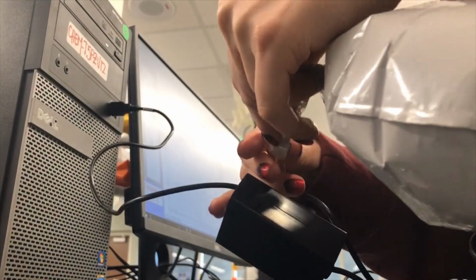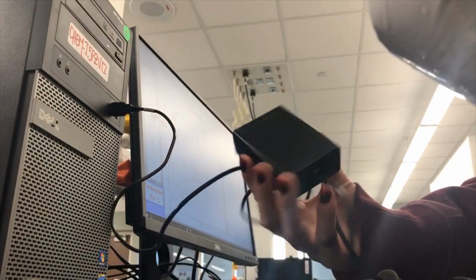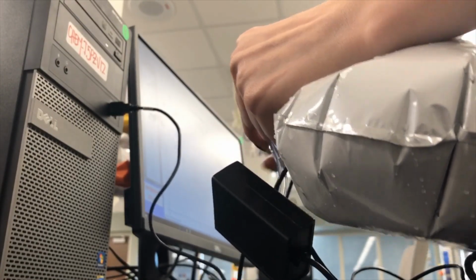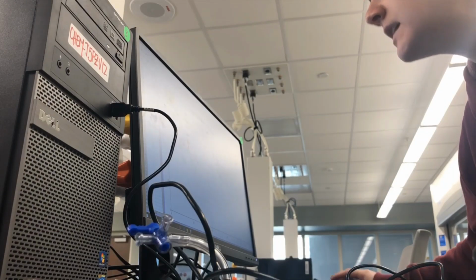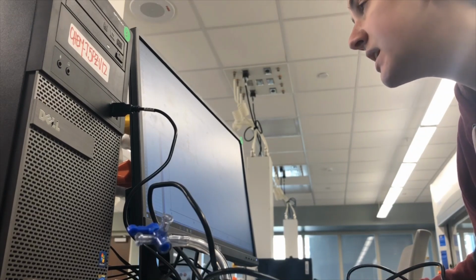Okay, so now I'm going to hook it up to the pressure gauge. Just have to set this up to get the pressure reading.